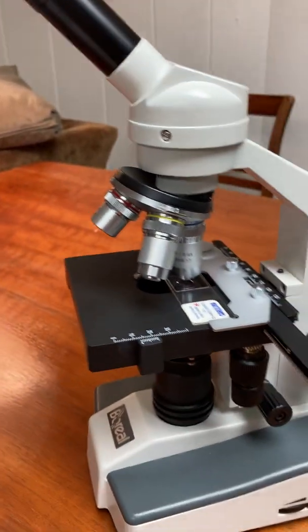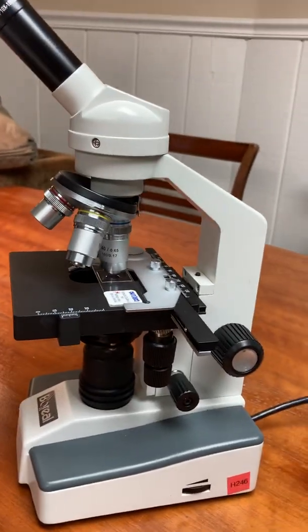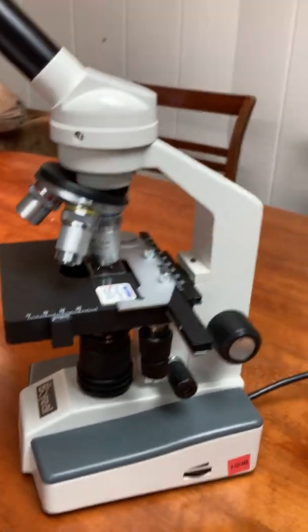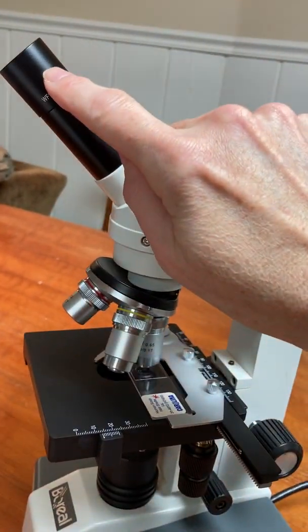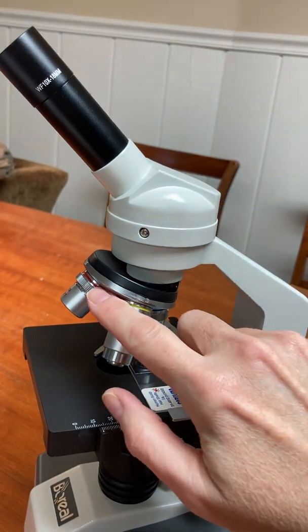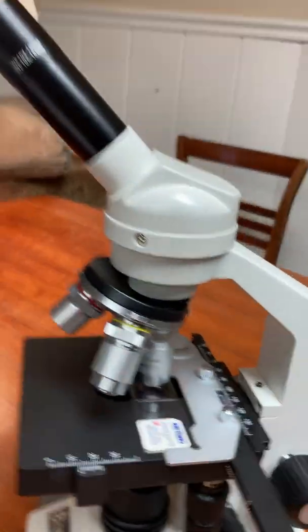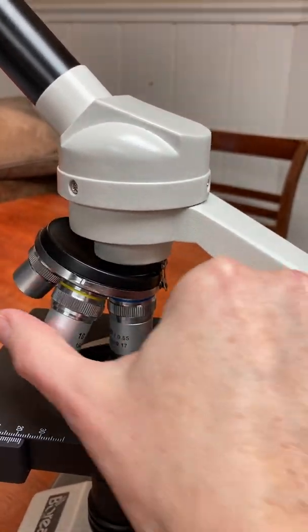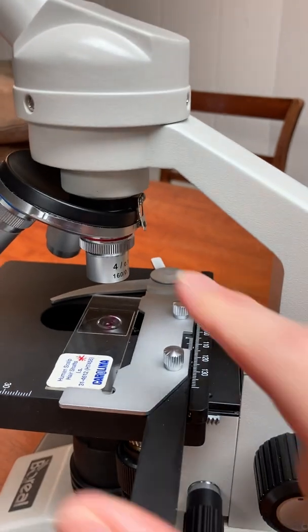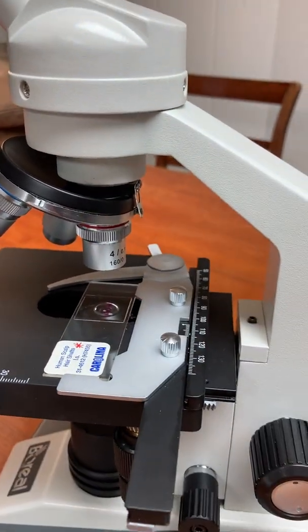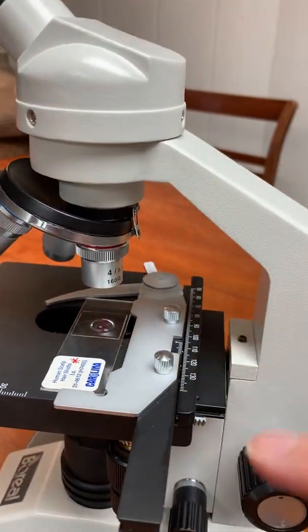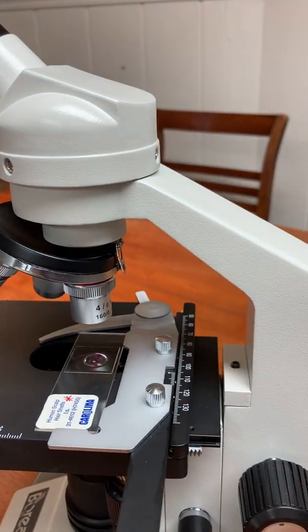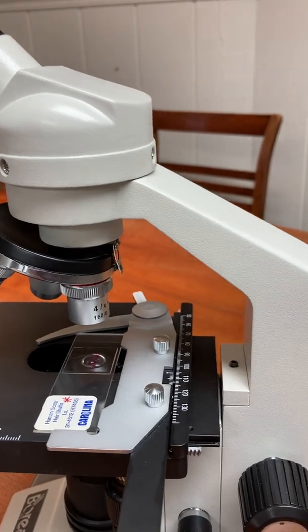So to calculate the total magnification, which you surely will have to do not just on the lab, but probably on an exam is you multiply 10x for the ocular lens times whichever objective lens is in position. In position means that it is sitting on top of the specimen. So right now I have the scanning power objective in position and then the total magnification would be 10 for the ocular lens times four, 10 times 4 is 40. This is the lowest power that we have.